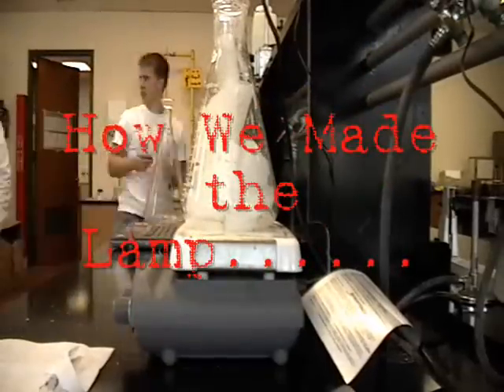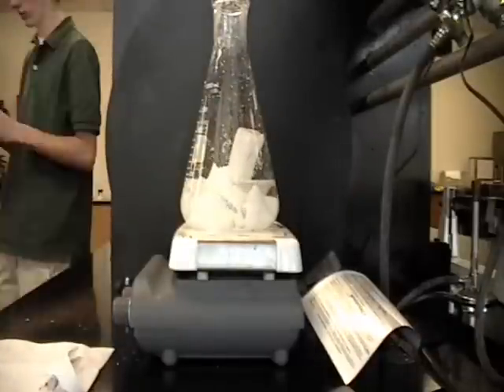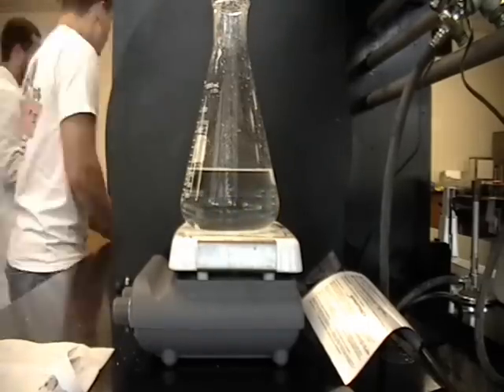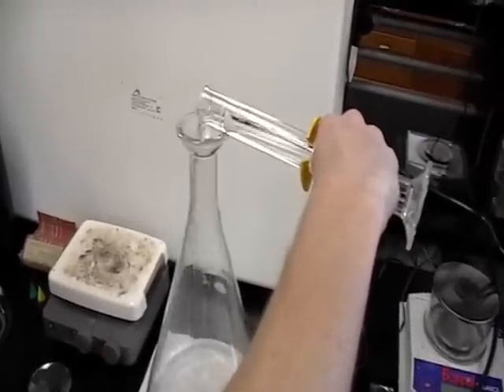First, we melted 1,000 milliliters of wax in an Erlenmeyer flask placed on top of a hot plate. After the wax melted, we poured it into the larger flask, which we used as the lamp. Then, we added 80 milliliters of perchloroethylene to the wax in order to raise the density.